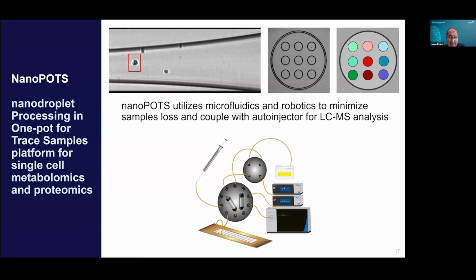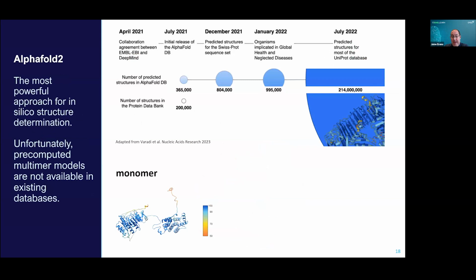And very excitingly, they've been able to start to identify metabolomic changes from these single cell experiments truly at the single cell level. So this is another exciting aspect of work that could be done within the 1,000 Fungal Proteins project, if interested.